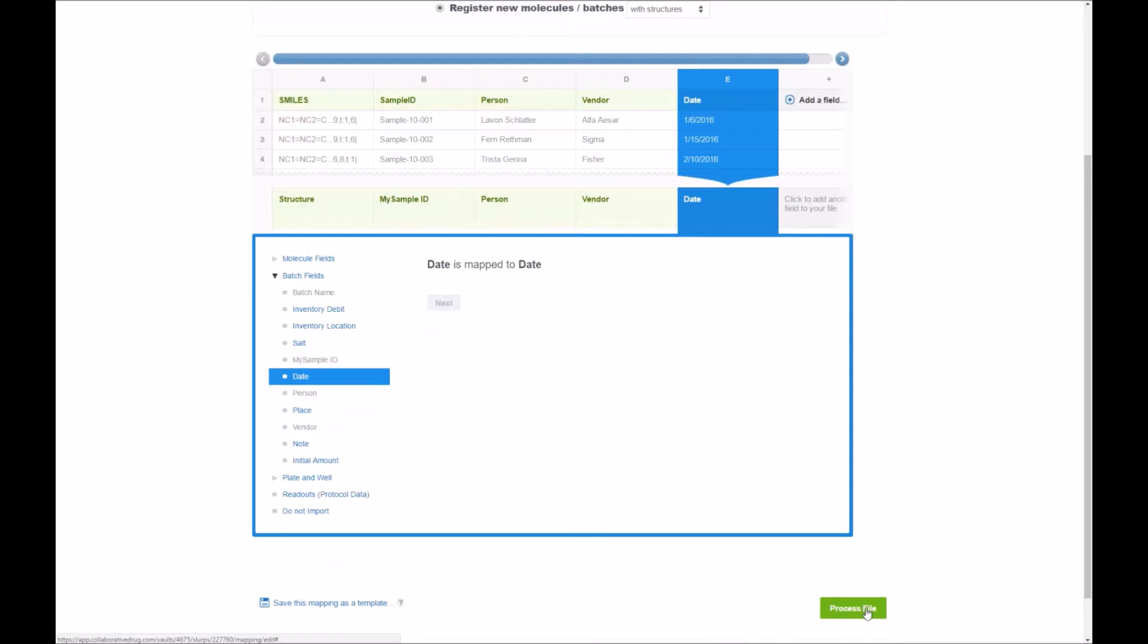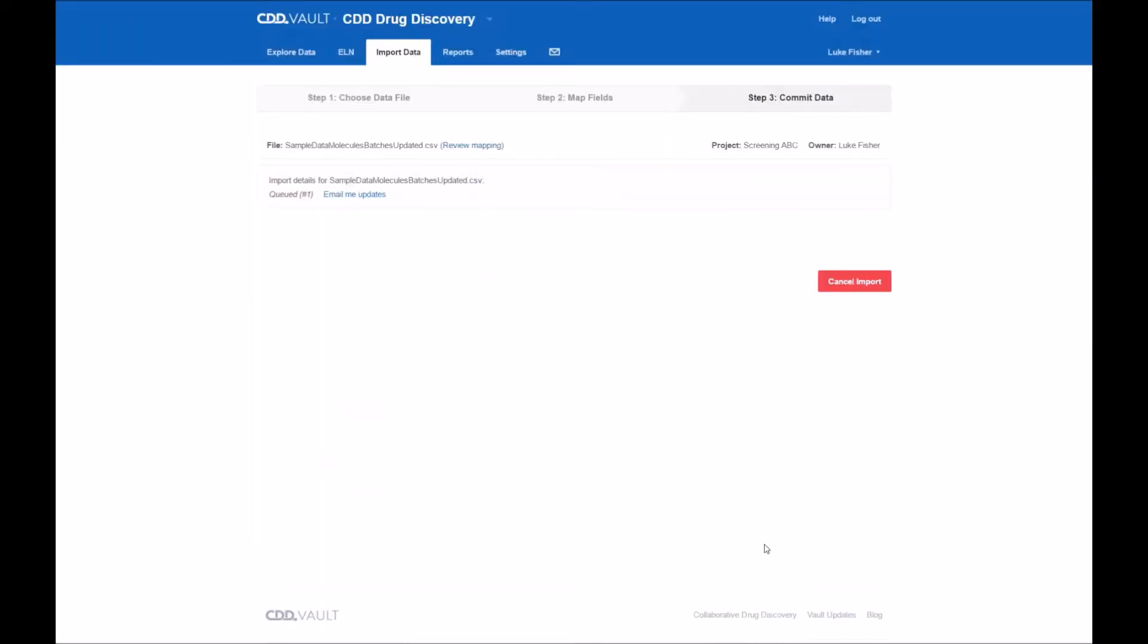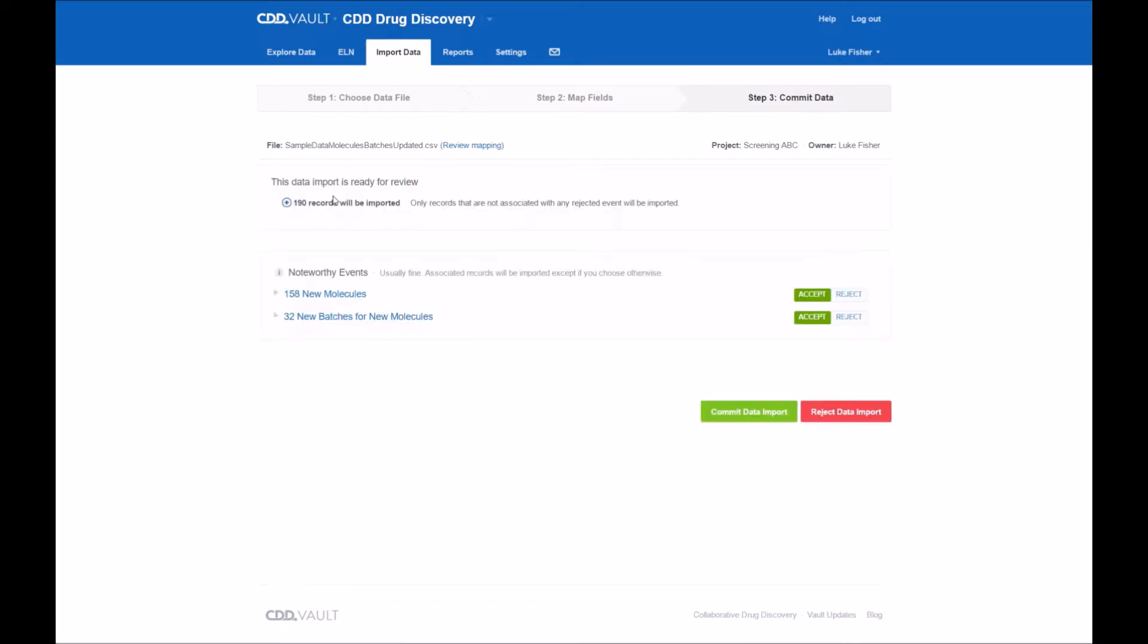Once we have mapped everything as we'd like, clicking process file, the big green button, you'll go to the next screen which is a review screen. You'll see that it's going through each of those different steps, it'll go into a queuing status. If it's a large file it'll even give you an option to allow you to email yourself when the upload is complete or the import is complete. This is such a small file it only had 190 records that happened just in a few seconds.